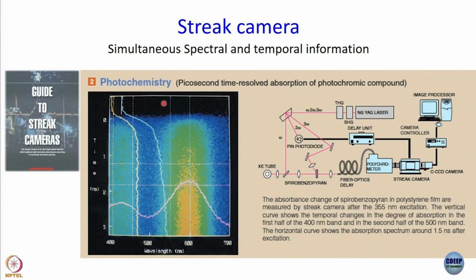So, nowadays for the nanosecond, microsecond time domain, this has become a more popular technique than using just MCP-PMT, because you can see time resolved emission spectra, and if you use a short enough pulse, you do not have to worry about deconvolution or any such thing. So, this becomes very useful. Okay. So, you can use both the axes.